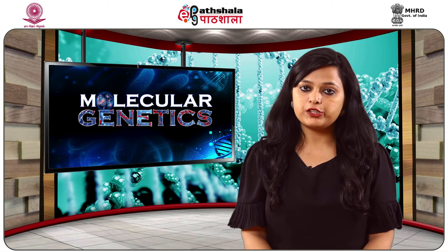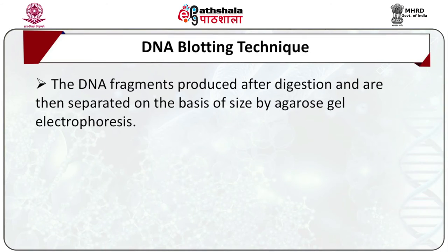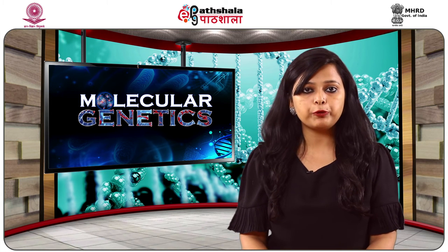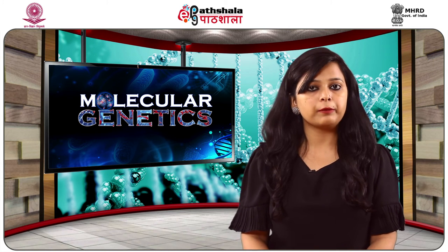After DNA purification, treatment with restriction endonucleases is carried out. The DNA fragments produced after digestion are then separated on the basis of size by gel electrophoresis. Prior to Southern blot, this gel is given a pre-treatment with 0.25 molar HCl for 30 minutes and then with an alkaline solution, which might be 0.5 molar NaOH. HCl treatment causes depurination by cleaving the glycosidic bond between the purines and deoxyribose sugars.